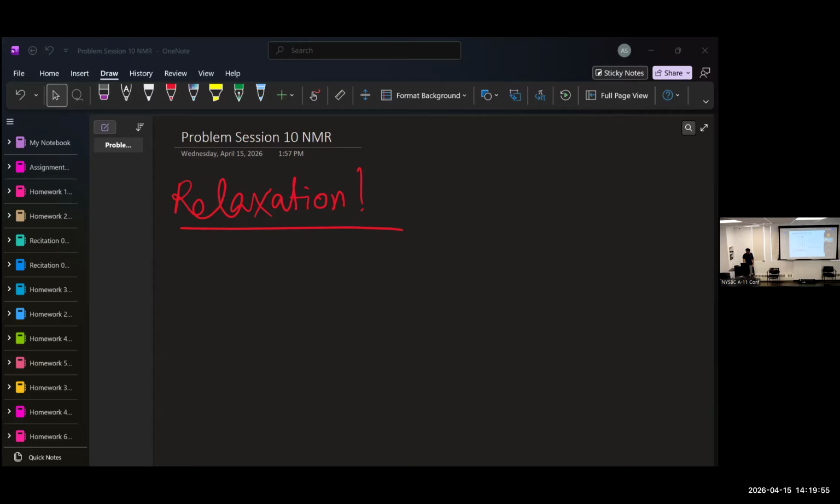In this experiment you knock the magnetization down with a 180, hold for some period, waiting for it to recover towards equilibrium, then a 90 pulse to measure the intensity, and that gives you a curve like this, which is the inversion recovery curve. Then we talked about the spin echo, which is T/2, 180, T/2, essentially refocusing chemical shift evolution to see how much transverse coherence is lost to T2 relaxation.